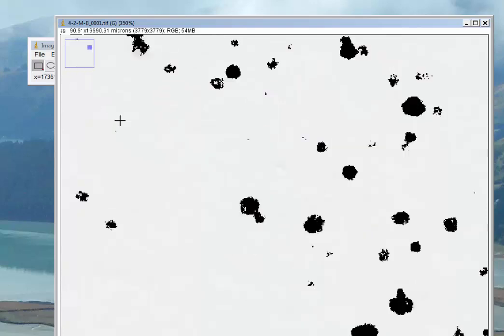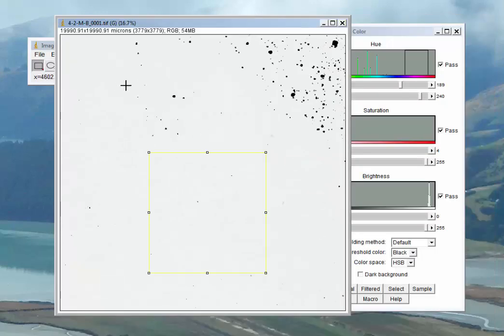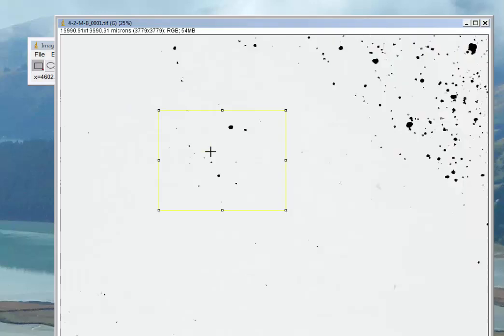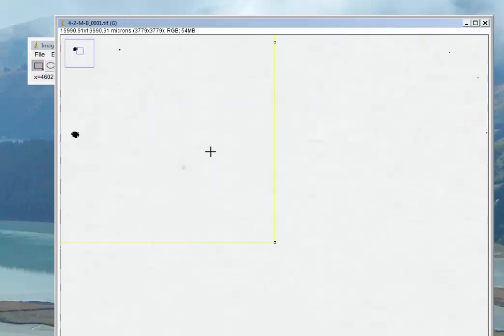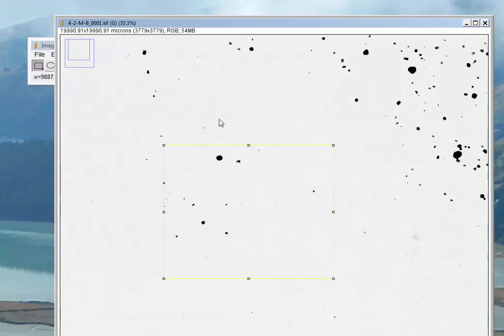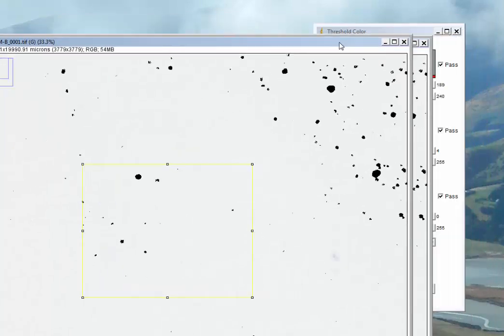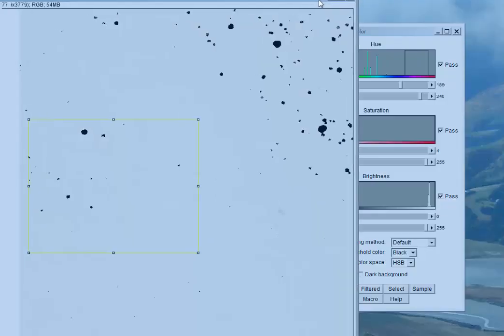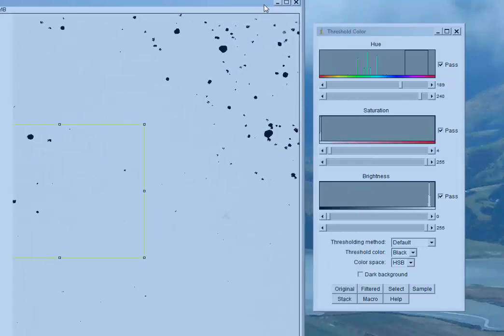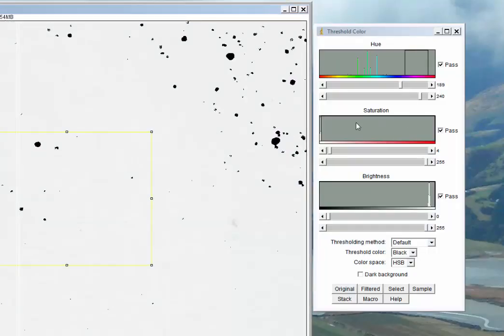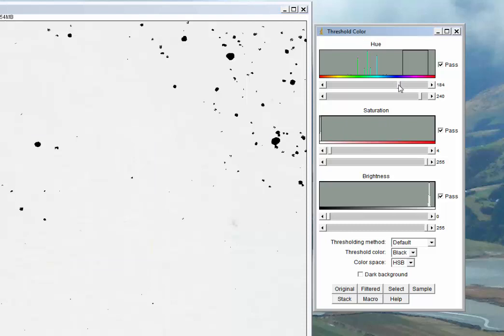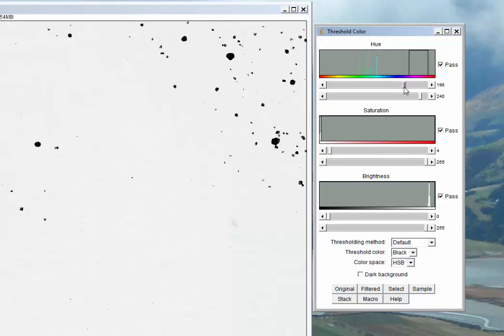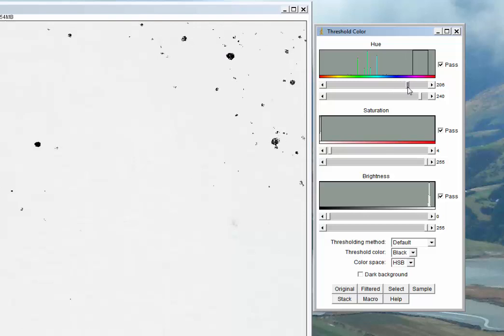We're getting close to those single singular pixels now. We can move back and forth to see what this actual threshold means to us here. Remembering back to our blank calibration, somewhere between three and four we knew we had almost no background anymore. This is the art of it: looking at the stains, trying to decide are we actually looking at something real or not. Most of these look more or less like some sort of roundish stain.